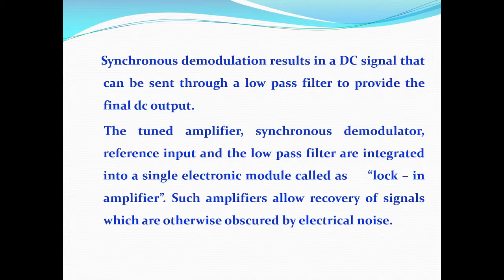So, synchronous demodulation also results in a DC signal that can be sent through a low pass filter to provide the final DC output. Sometimes what we do is make a compact device using a tuned amplifier, synchronous demodulator, reference input and low pass filter. They are all integrated into one small single electronic module called a lock-in amplifier. Whenever you want to buy an instrument, sometimes the instrument seller will say, sir, we have got lock-in amplifiers, so you do not have to worry much about the signal display and signal quality.